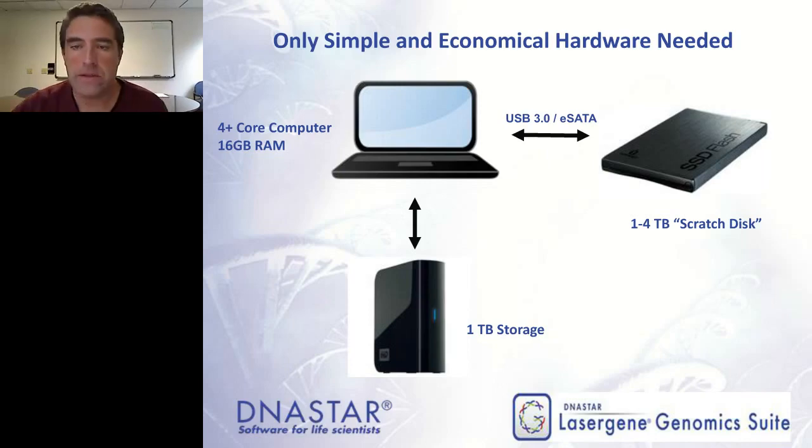And what we generally recommend is a computer that has a processor between 4 and 8 cores, 16 gigs of RAM, and you have adequate storage.